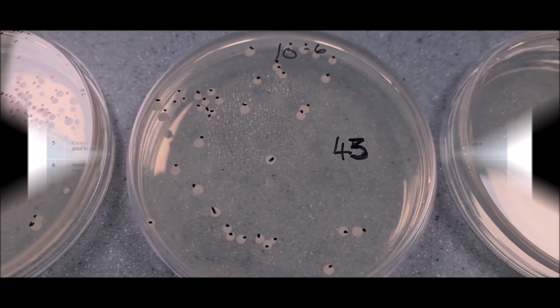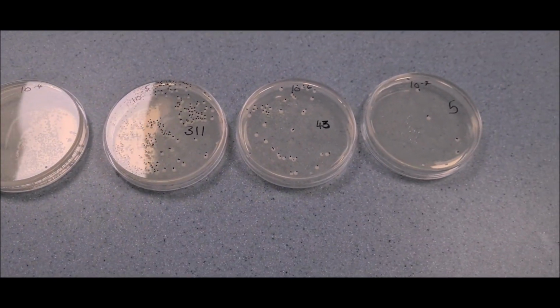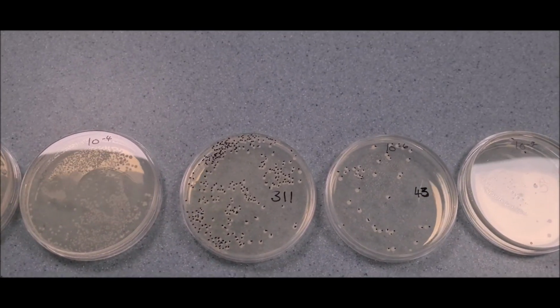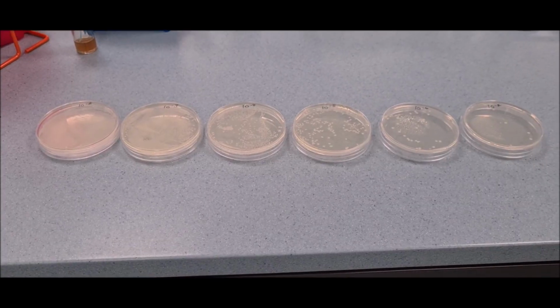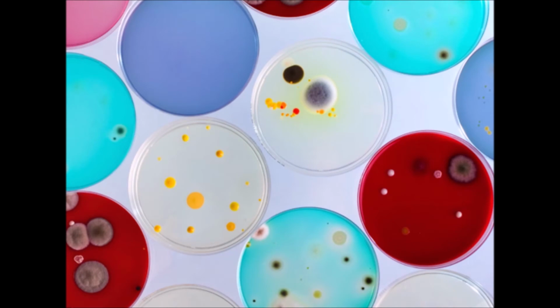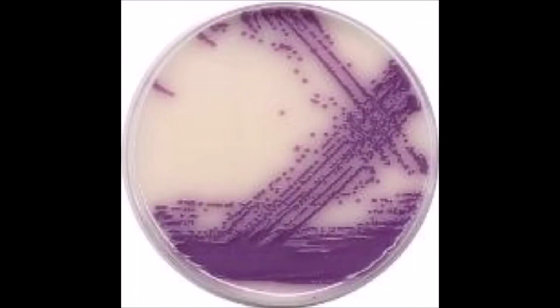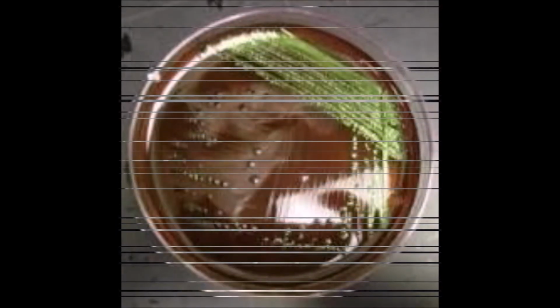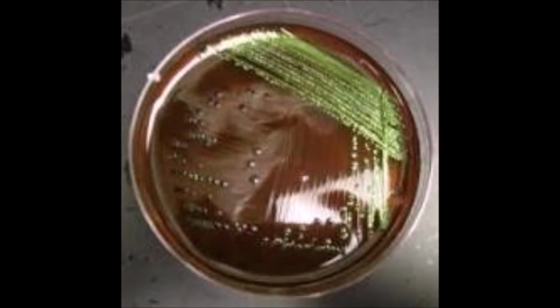The result of the total viable count is also used to estimate shelf life and incipient spoilage of food. For instance, in the case of meat products, incipient spoilage is said to occur at a total viable count from 10 to the power 7. For foodborne pathogens, there are two approaches to result interpretations. In the first approach, pathogens that require 25 gram of food sample for analysis are considered, for example, Salmonella, Campylobacter, Listeria, pathogenic E. coli, etc. These require a simple presence or absence test in a 25 gram of the sample.